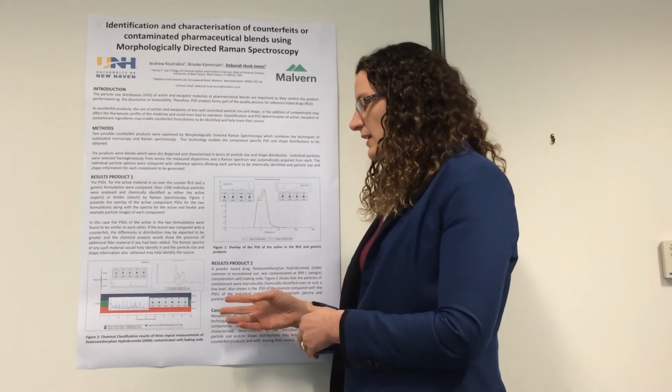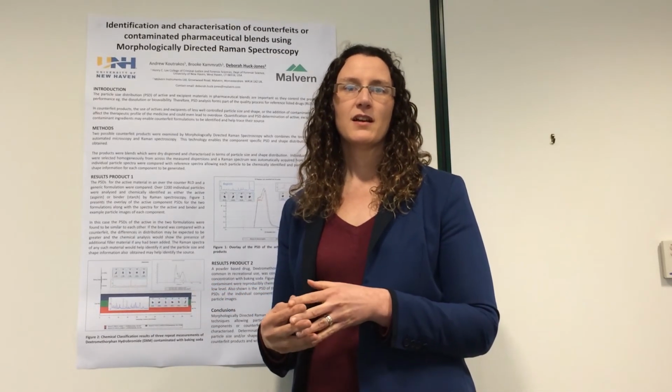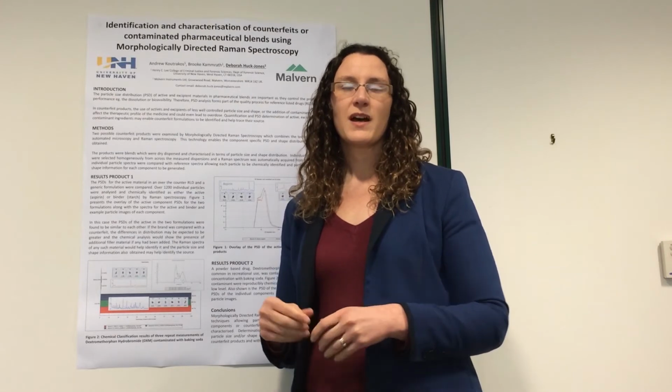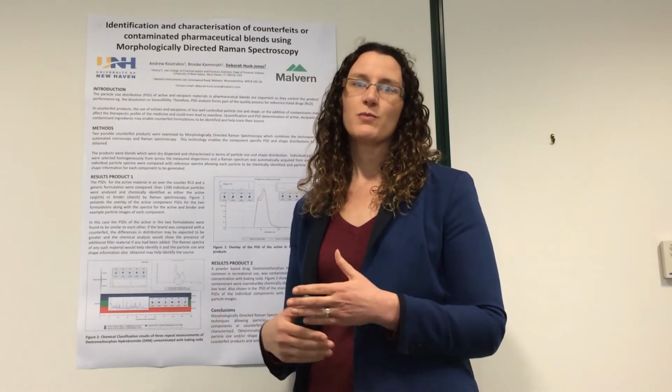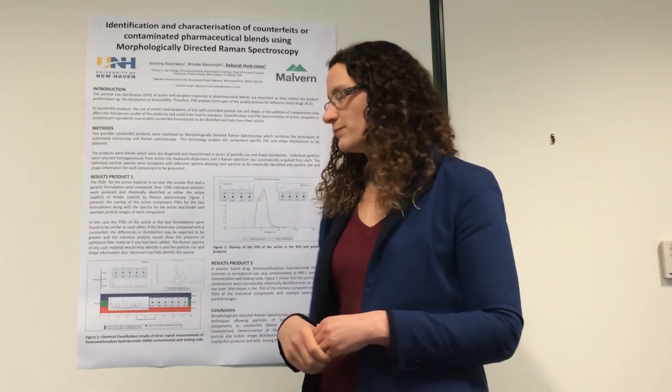the second one. And this is the analysis of a drug that's commonly used for recreational purposes that's been contaminated by something else. Now, if that was something highly dangerous, it would be very important to understand if there was a contaminant, even in very small amounts.